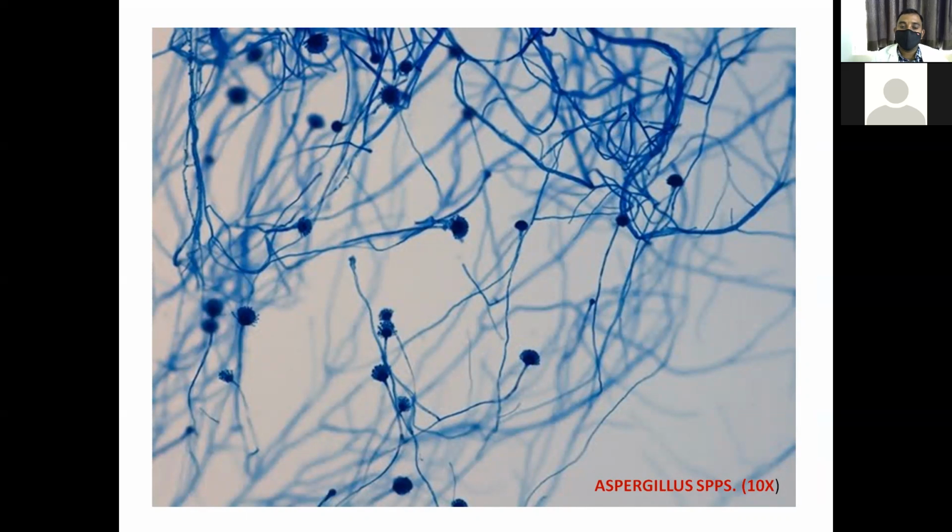Once you finish putting up the slide culture technique, after 48 hours or 24 hours, you will observe whether the growth contains reproductive structures like the growth you have seen. Then these reproductive structures, like conidia, conidiophore, and hyphae, you can observe very clearly in microscopical examination. Till now, you followed macroscopical examination. Now, microscopical examination.